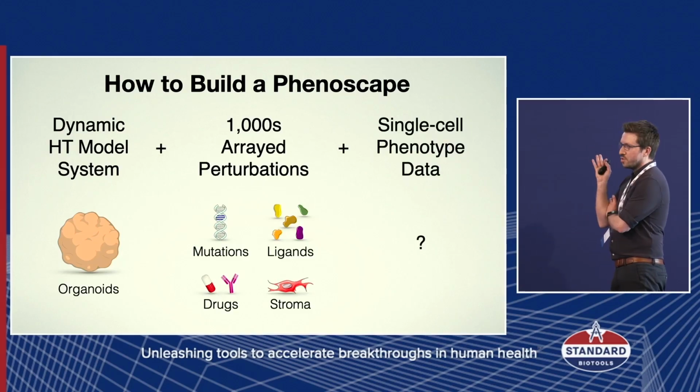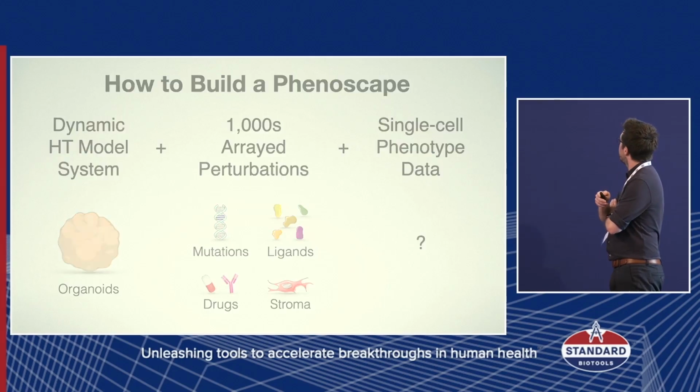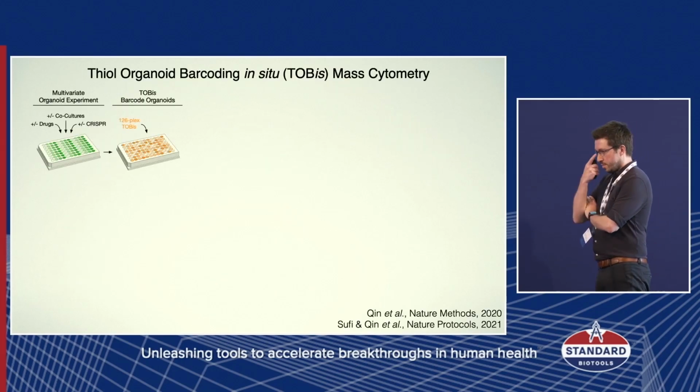So normally at this point in the talk, people expect me to reveal some sort of single-cell RNA-seq technology that will do this, but obviously, with the context we're in at the moment, you know what the answer might be here, and for us, it's CyTOF. But it's a particular type of CyTOF.